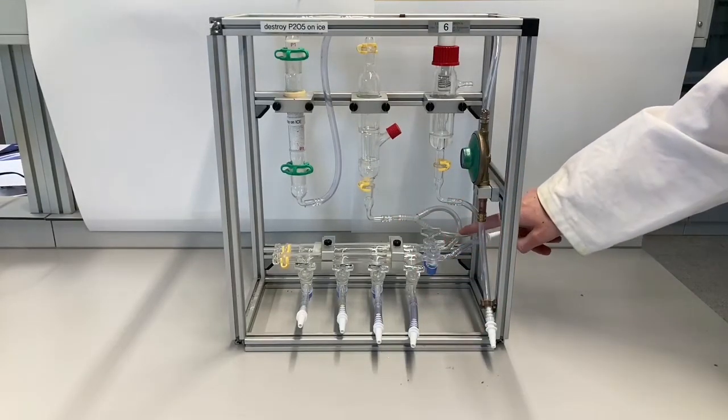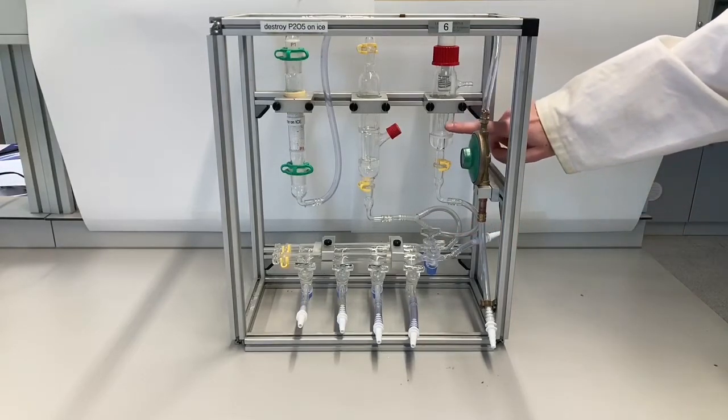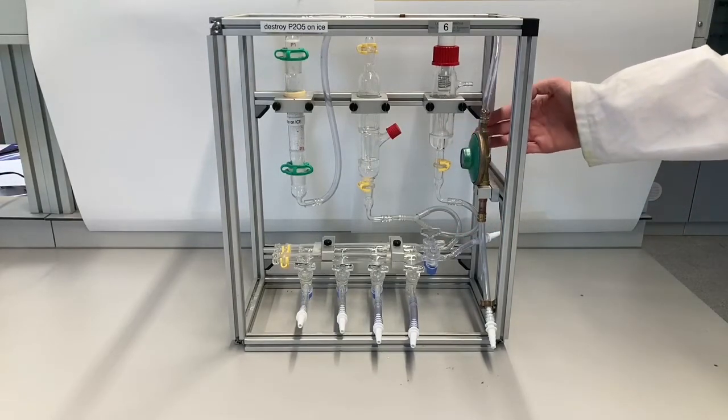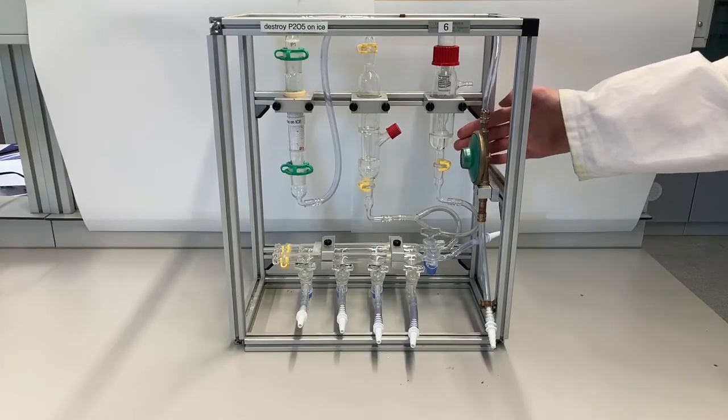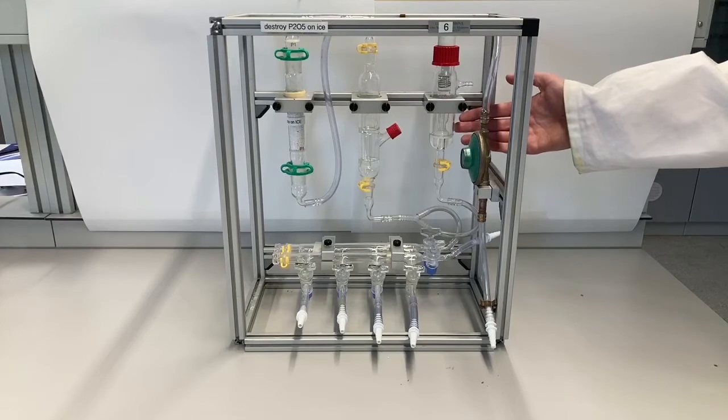The double manifold is also connected with an extra pipe to this overpressure valve. So for example, if your reaction produces gas, the overpressure valve will release that pressure so there will be no pressure build-up in your reaction.